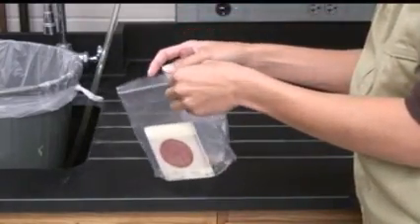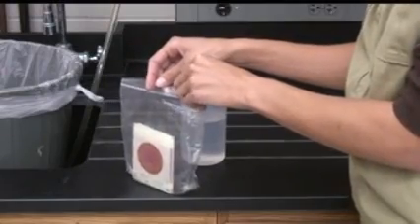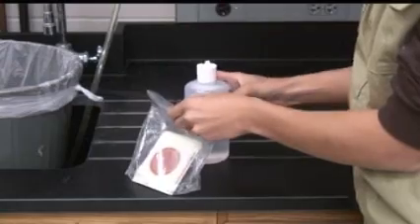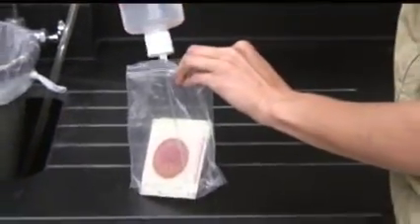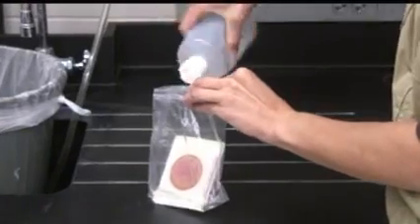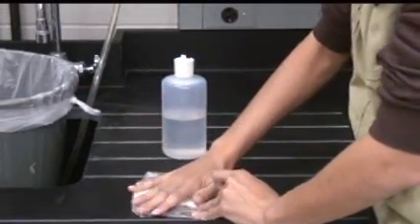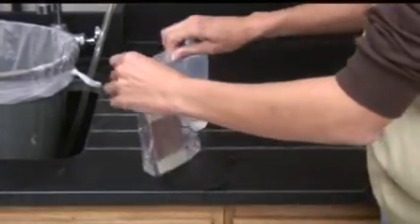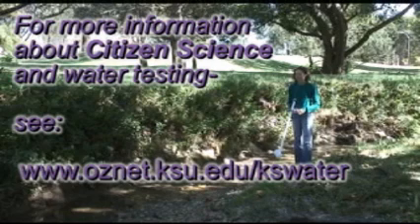Since we are culturing live bacteria in this test, it's a good idea to use a bleach solution to kill the bacteria before disposing of the plates. Put your plates in a plastic bag and then add at least a 10% Clorox solution — this one was made up as a 50% solution. Squirt some into the bag, then seal the bag and drop it in the trash.